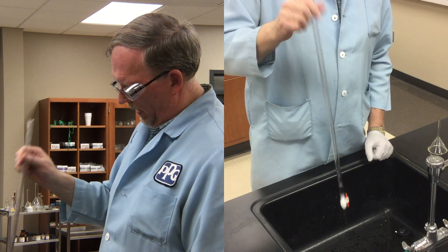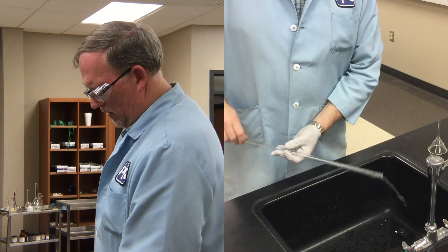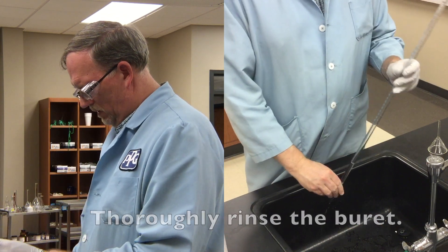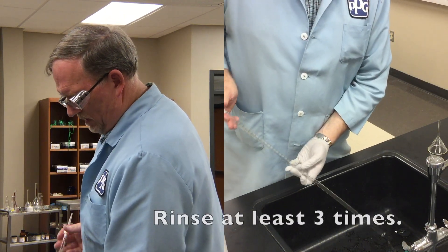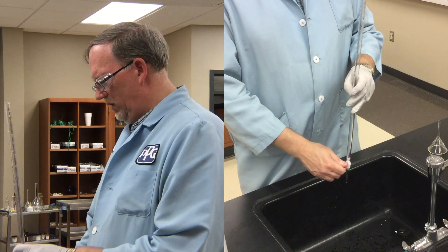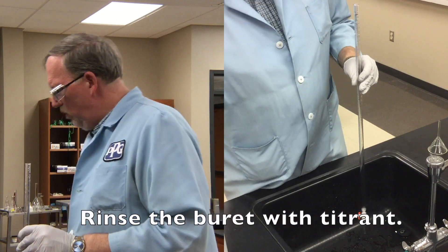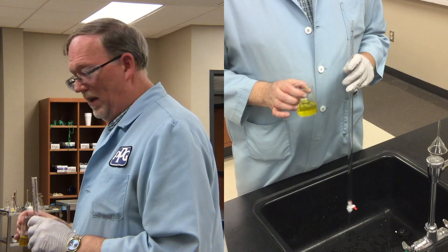The burette tip does tend to clog, especially if you don't clean it before you put it away. You only need a few milliliters of water to do this — you don't need to completely fill the burette. This burette is beginning to drain well. You should clean a burette like this at least three times. Next, we want to rinse the burette with the titrant. In this case, we're going to use a green solution to represent the titrant — the solution in the burette during the titration.